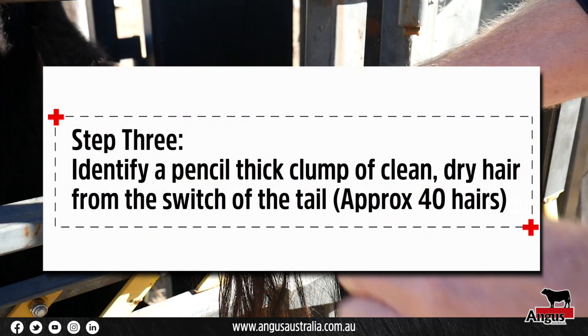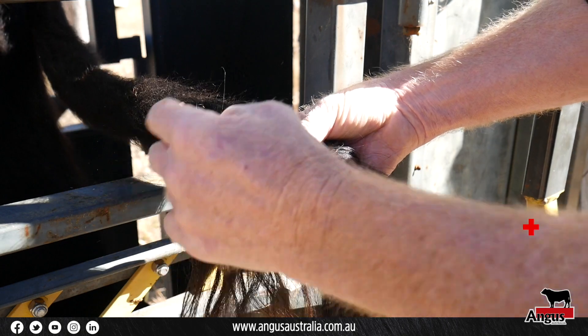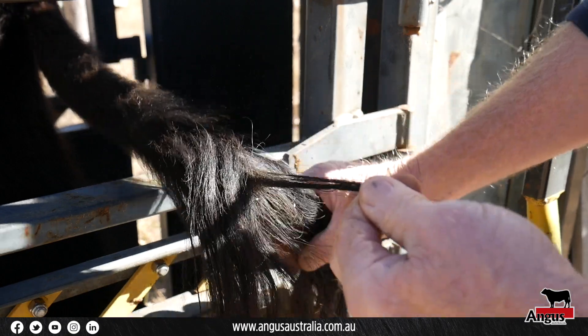While holding the tail switch, separate out a pencil-thick clump of clean, dry hair from the switch that contains approximately 40 strands of hair.